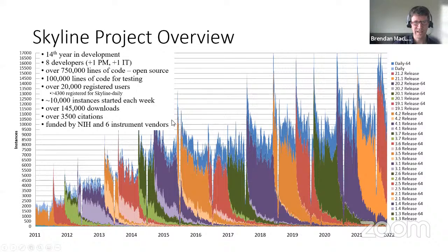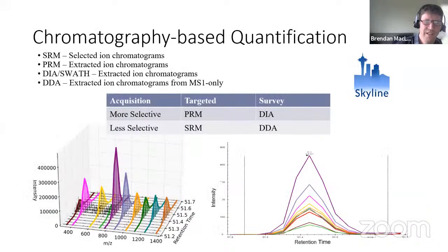And then the instrument vendors, we have 6 instrument vendors, and half of them now pay us through 3-year contracts. And so, yeah, there's no fear that Skyline's going away anytime soon.